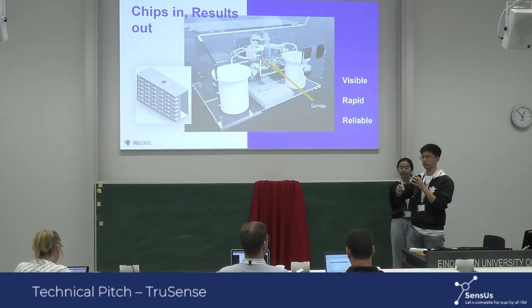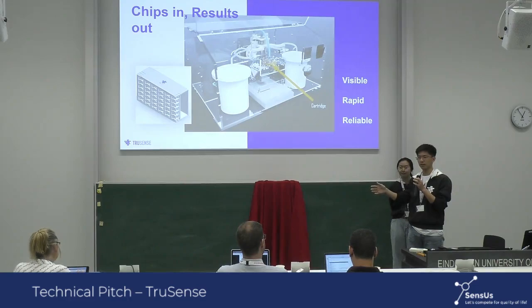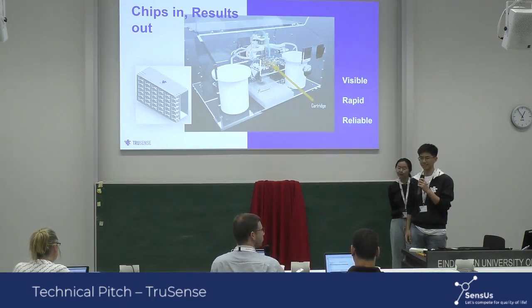And we use poly-L-lysine or chitosan to increase the group, and that will increase the signal. At the end, it will be the TNF alpha and some leftover anhydride groups. And we use an end capper to close all these anhydride groups. Okay, so you bind the TNF alpha on the polylysine? Yes, and it's through a covalent bond, so it's pretty strong. No, it's clear now. Thanks. Yes, thank you.